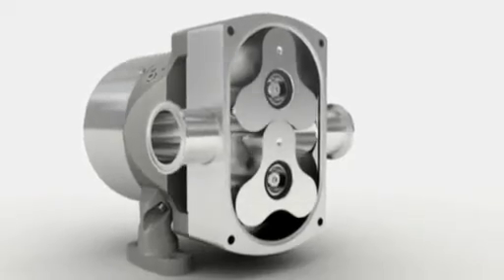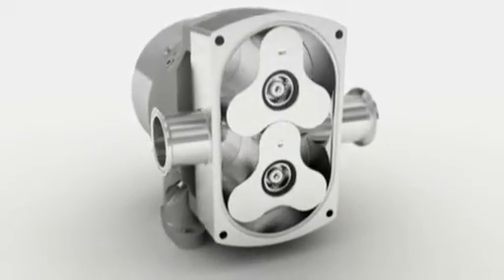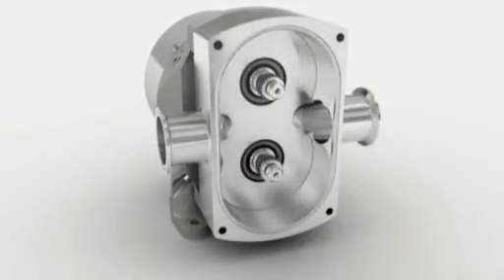The Optilobe features a rigid block design with heavy duty bearing system that ensures complete reliability in your process.